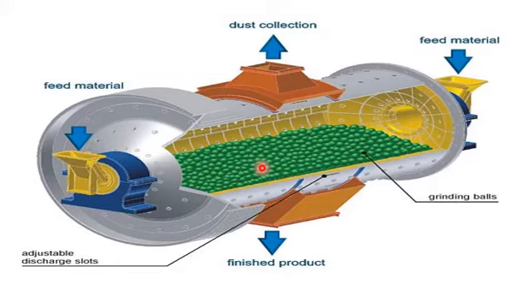So basically ball milling just grinds or shears or stretches the material mechanically, so it does not involve any kind of solvent during the process, and with the mechanical stress, shear or grinding, it converts a bulk material into a smaller, fine material.